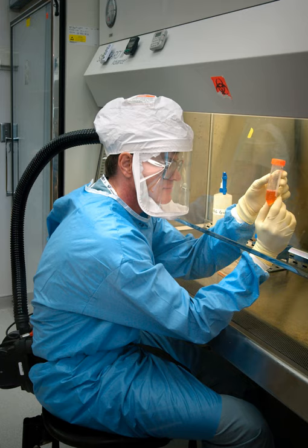Topic: Classes. The U.S. Centers for Disease Control and Prevention (CDC) classifies BSCs into three classes. These classes and the types of BSCs within them are distinguished in two ways: the level of personnel and environmental protection provided and the level of product protection provided.